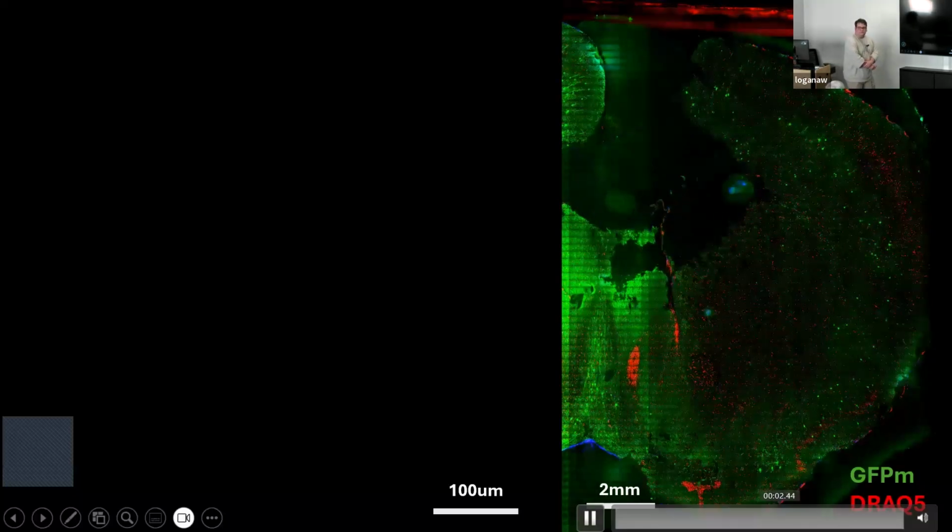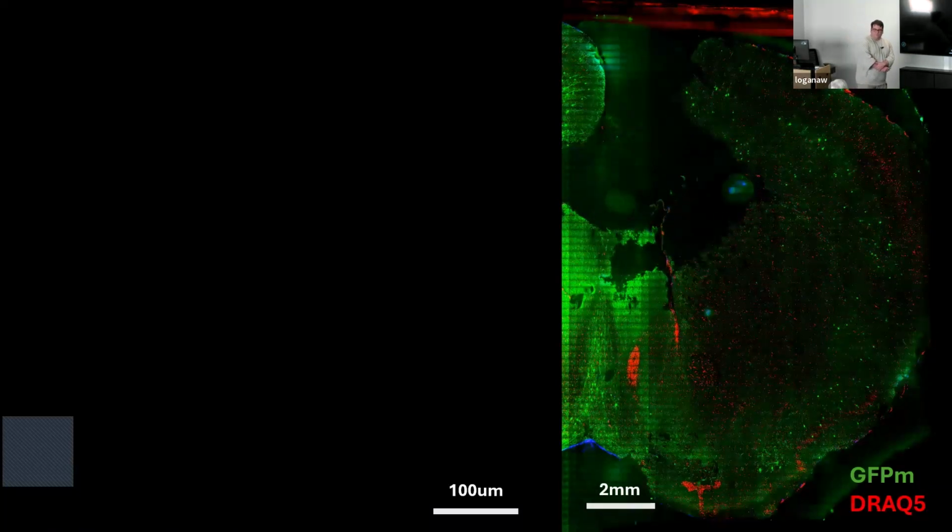If your pixels are as small as you say, and the time it takes to scan these runs hours to days, how do you know that the actual sample you're scanning hasn't moved physically and given you? So that is both a great question and a great challenge.